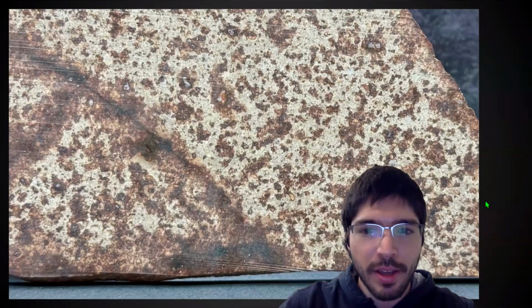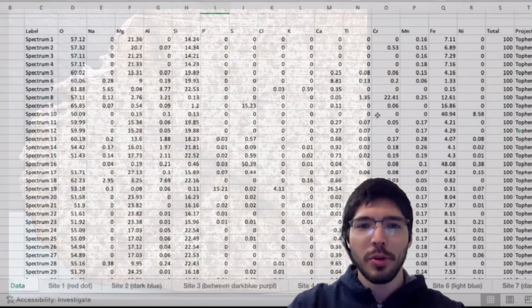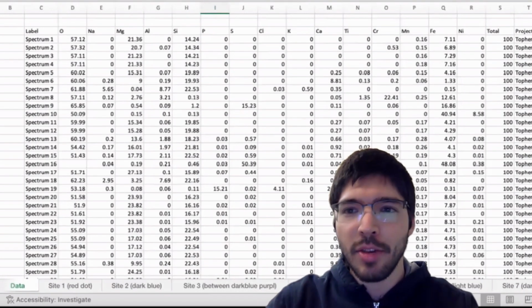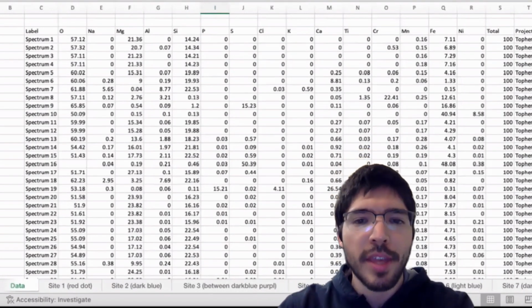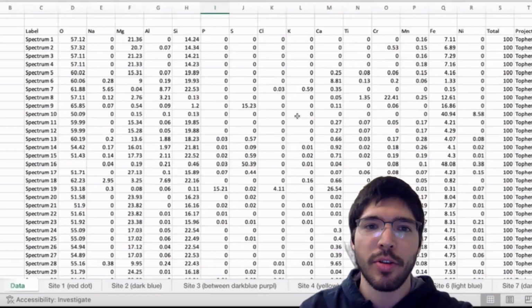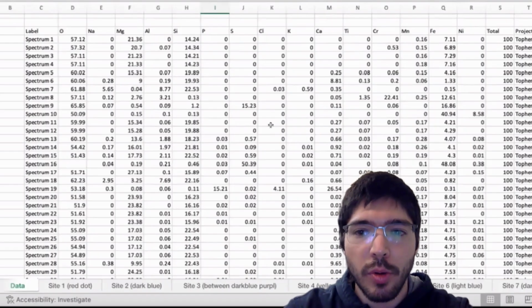All right, man. I'll let you share whatever media you want to share, and you're on your own. All right, sounds good. Okay, so while everyone's adjusting to all of the data and numbers that appear on your screen, let me just say that this is the data after we've processed it onto the Excel spreadsheet, but it's nowhere near complete. We now have to actually do a bit more processing here.